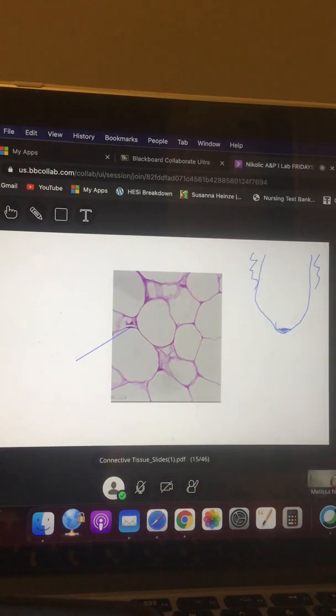So sometimes there are things like, for example, in interphase and prophase, you really want to make sure that when you're looking at interphase, you see that clear nuclear membrane, and when you're looking at prophase, you don't have a nuclear membrane. Those things are going to be really important to distinguish it. We try to find the example that is as clear as possible.